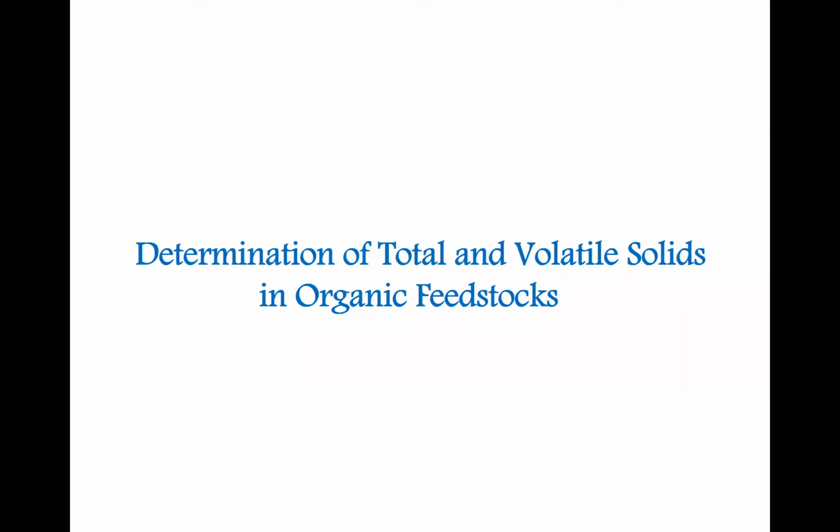Hello everyone. Today we are going to introduce you to the determination of total and volatile solids in organic feedstocks. This short video is just to get people who are not familiar with these two terminologies to understand what total solid means, what volatile solid means, and how we can determine them in the laboratory.